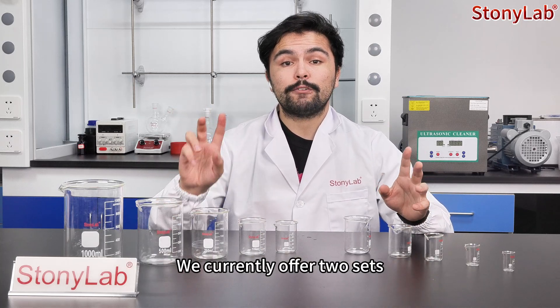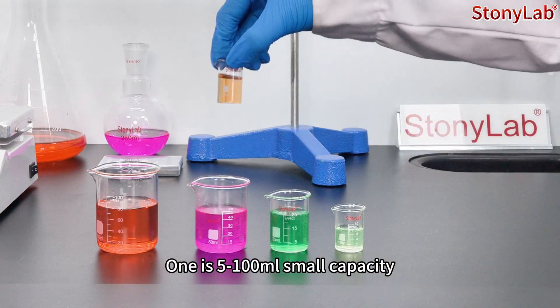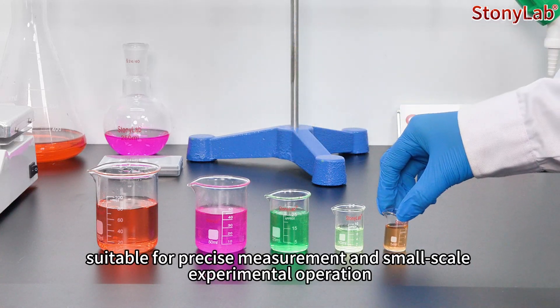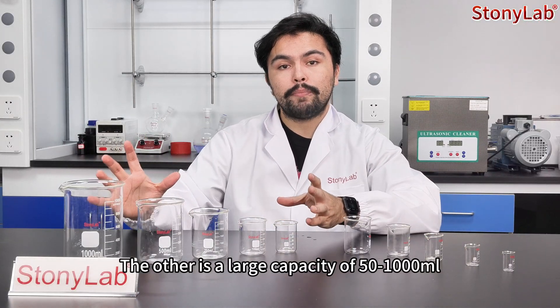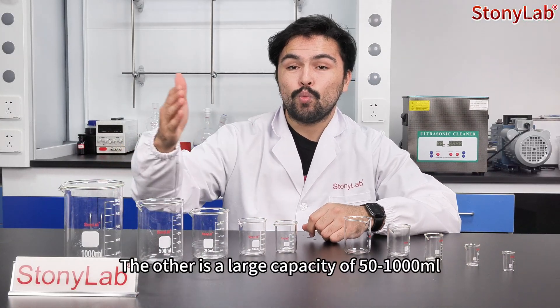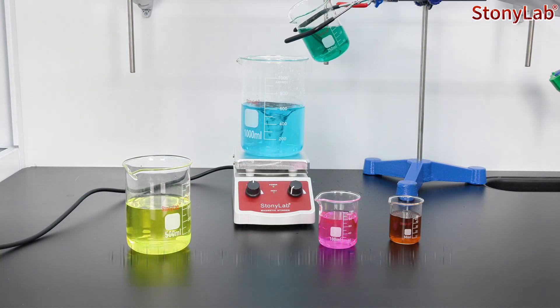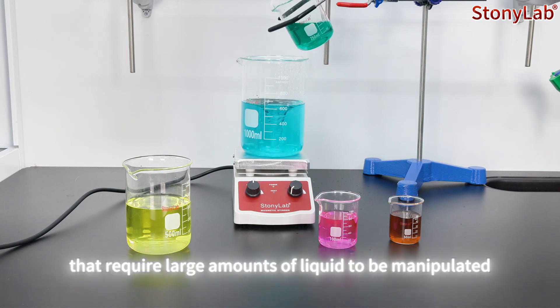We currently offer two sets. One is 5 to 100 milliliters — small capacities suitable for precise measurement and small-scale experimental operations. The other is a large capacity of 50 to 1000 milliliters, which is particularly suitable for experiments that require large amounts of liquid to be manipulated.